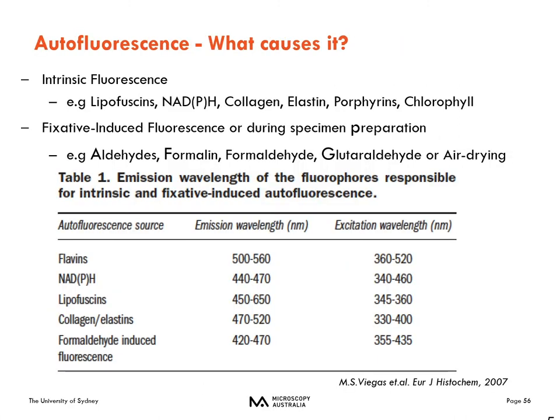A big source of artifact is introduced by autofluorescence. So when we talk about autofluorescence, we want to know what caused it. It can be intrinsic fluorescence from the sample, such as lipofuscins, NADH, collagen, elastin, etc.